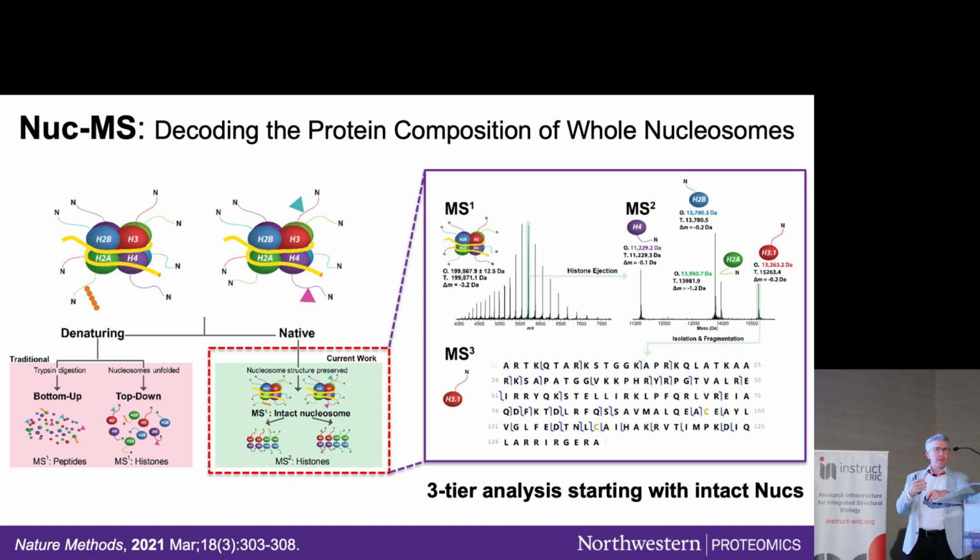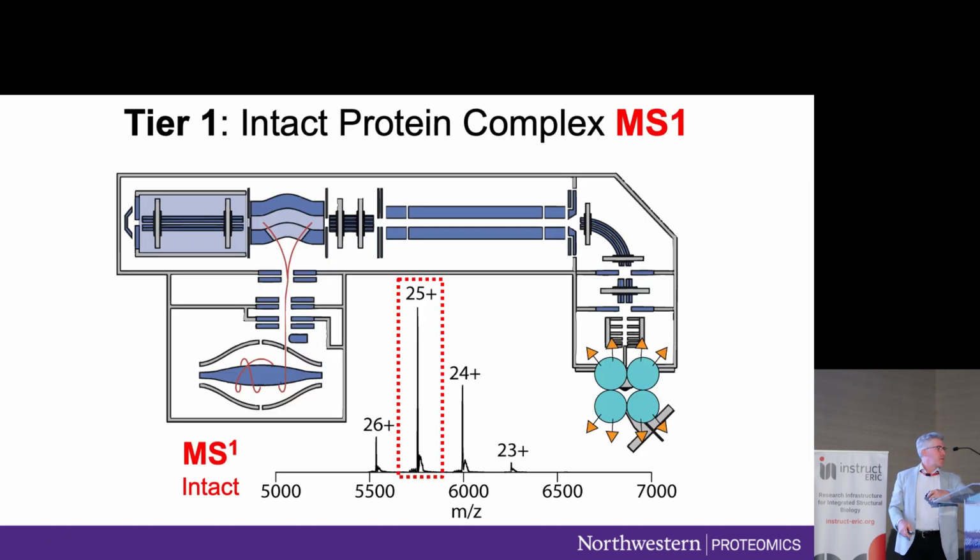And the nature of our data are these blue flags, these fragment ions, which you could kind of think of as tryptic peptides. They're sequencing equivalents, right? But we use no digestion throughout this process. There is no protease involved in this. And so here's, again, a picture of how this works.